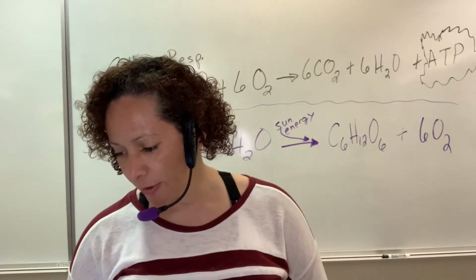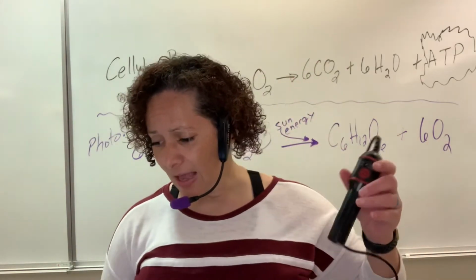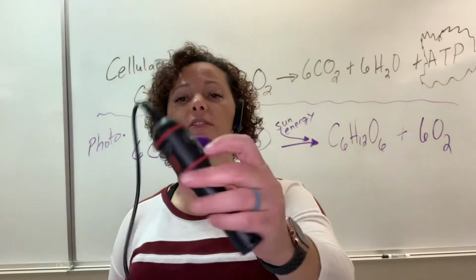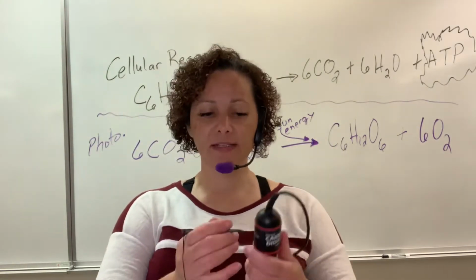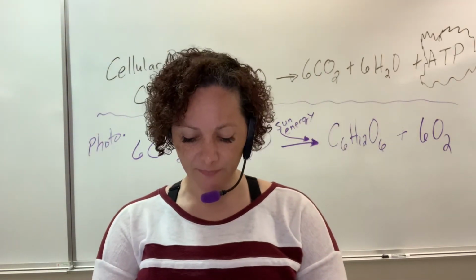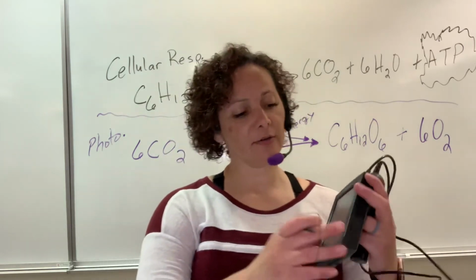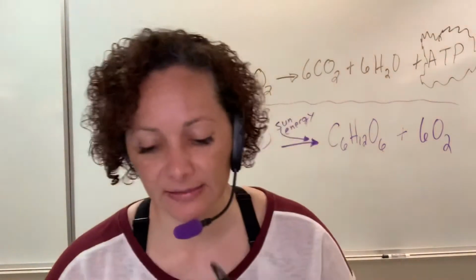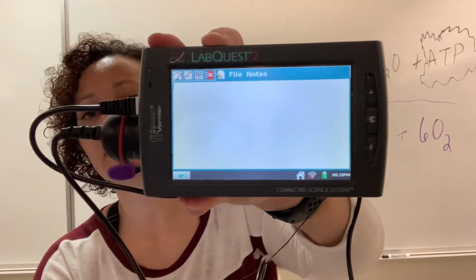It says enter the pointer into the calibration. So we need to calibrate this. As you calibrate it, what you need to do is there's a little hole on this back side. Okay, you're going to place the pointer into the calibration button. If you find you have stuff on here, why don't you empty it? See, I have things. Let me go ahead and erase. I have things on there that are in the way.